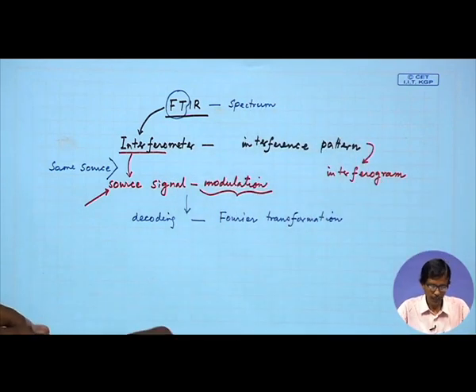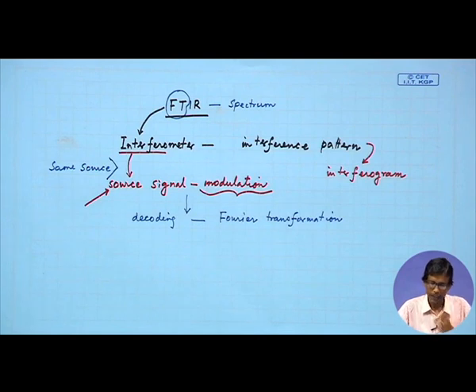In that way, we will be able to get the corresponding FTIR spectrum.